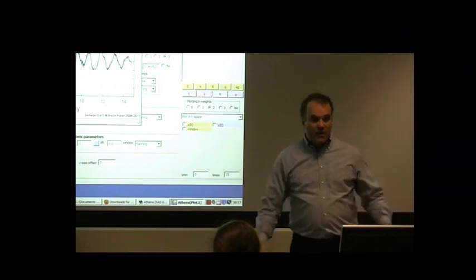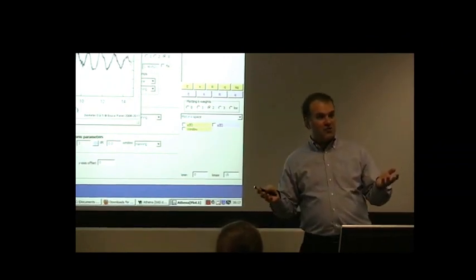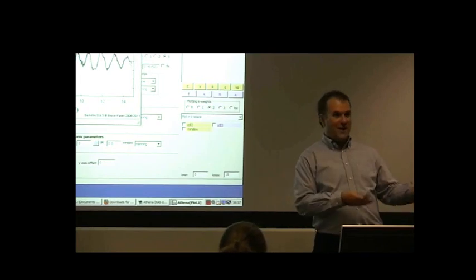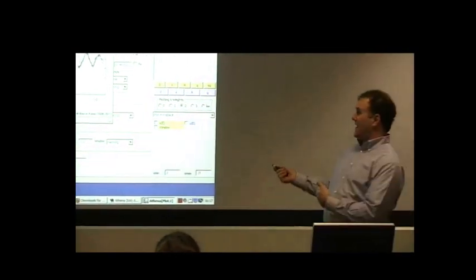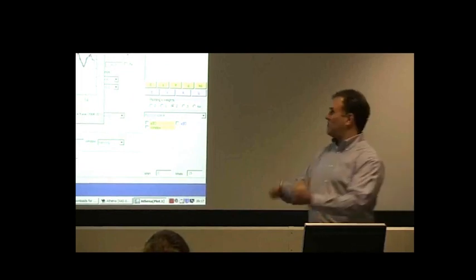The general answer to how far out in k or how far out in energy you should measure data is: keep measuring data as long as there's data, right? Don't walk away from data. If there's something to measure, by all means measure it. Most of the time you won't have data out there, so when you run into that situation, you should luxuriate in it and measure it all.